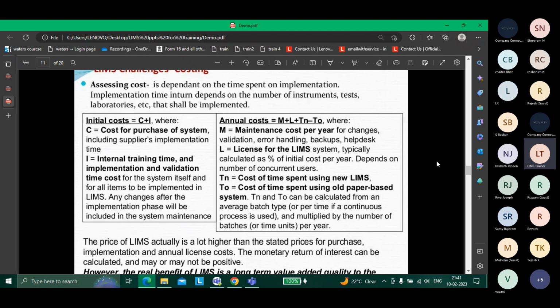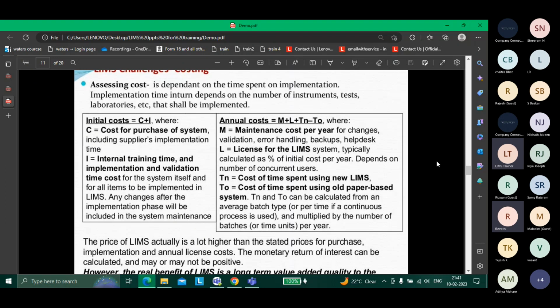Then you come to the product, because product has your analysis, and when you log the lots using those products, your samples come up. Those I'll come to later. I believe this should be your approach. But again, if you come with a top-down approach, that way I should know how a product is built in product specification designer. That is also okay if you read in parallel, but I believe both sides are true.